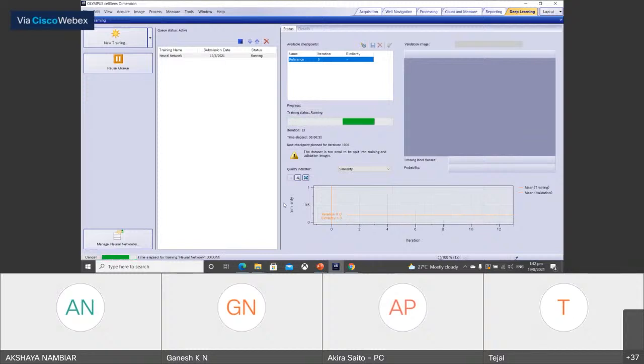But if there is a very wide variety of objects that are labeled, then the similarity cannot be very high. But you can see that with lots of iterations, the similarity goes to the peak. Then you can think to stop the training.